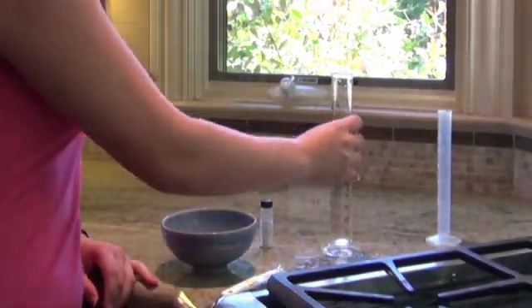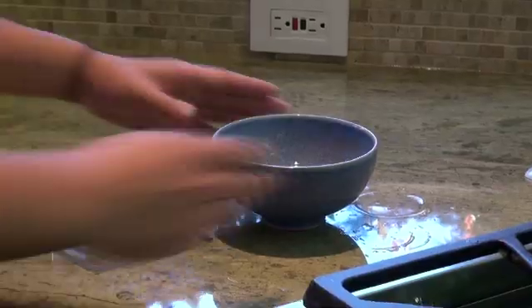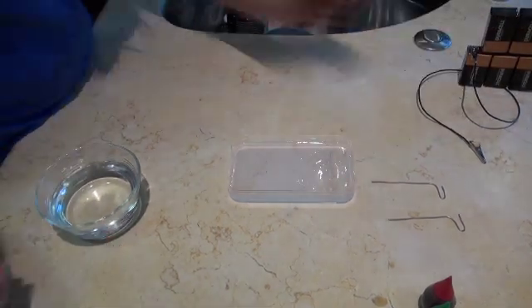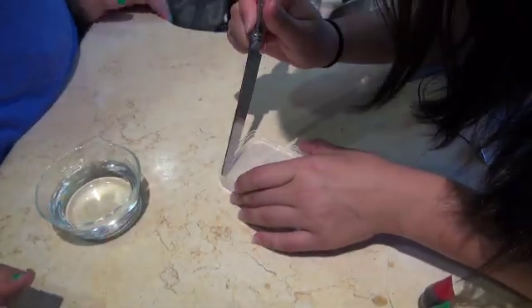Combine 100 milliliters of your buffer solution with about a quarter teaspoon of agarose powder and microwave. Carefully pour the hot agarose solution into a container with your 3-well comb placed about 1 centimeter from the end. Now that the gel has had time to set for about an hour and a half, remove the comb.